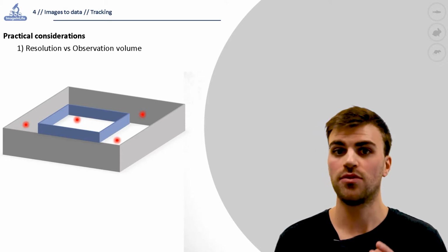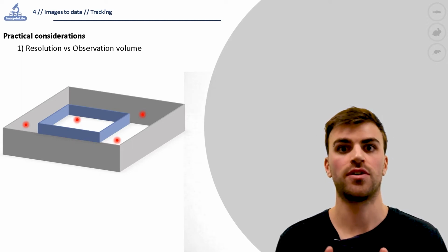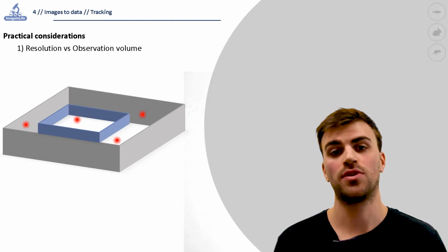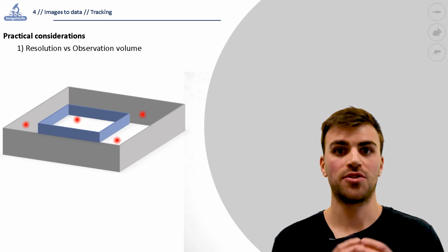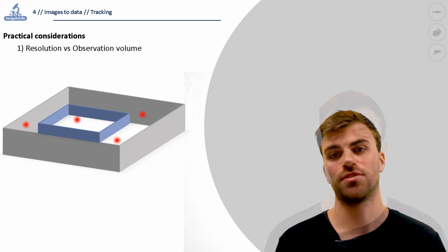On the other hand, if the resolution is too low, one cannot precisely quantify the displacement of the particle, nor precisely distinguish between neighboring particles. Keep in mind though, for fluorescent point emitters, subpixel localization is possible using a localization algorithm like Gaussian fitting, for instance.